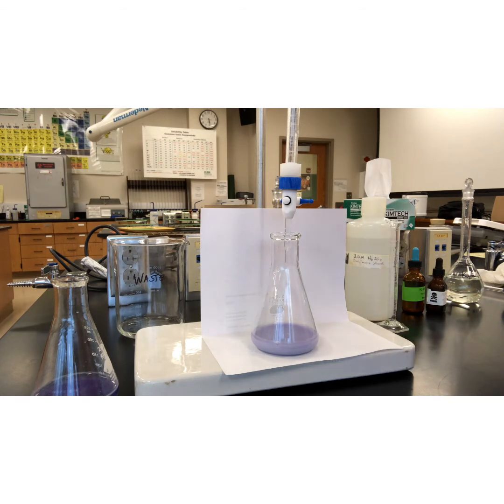Calculator. I want to calculate my delta V's to see if they were close enough to one another, and then we're going to do our third run.